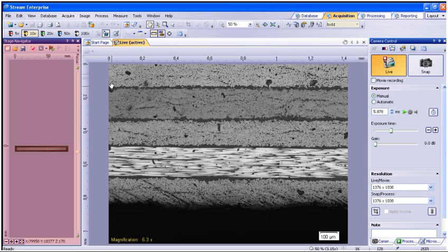To create a more uniform stitched image, utilizing a manual exposure or locking the exposure and shading correction is required.